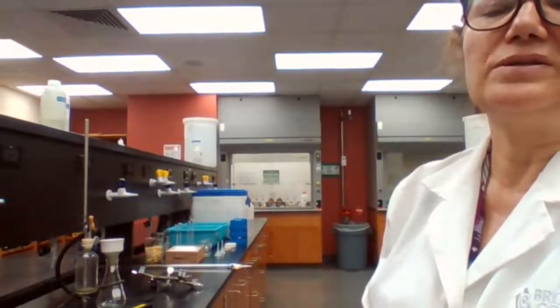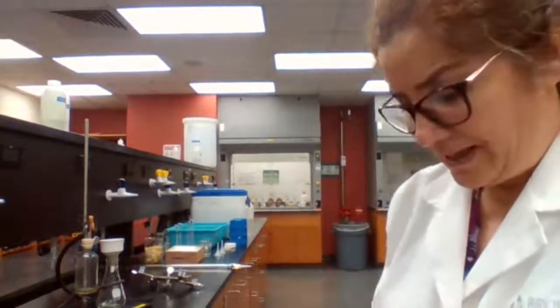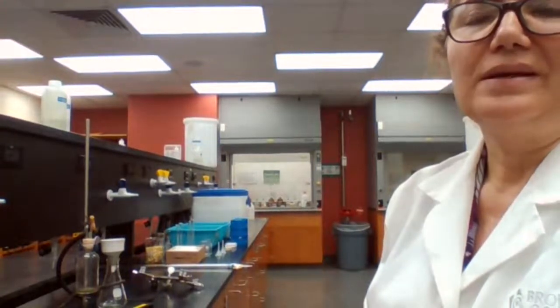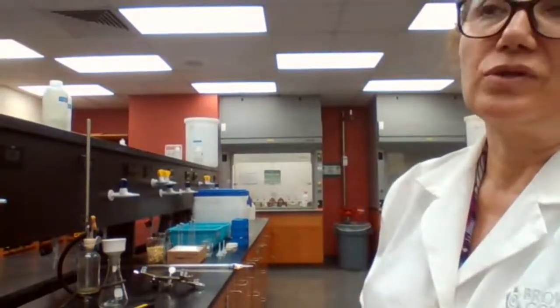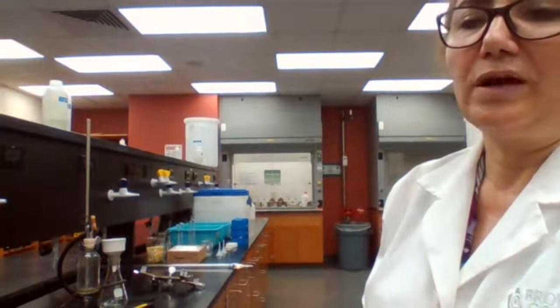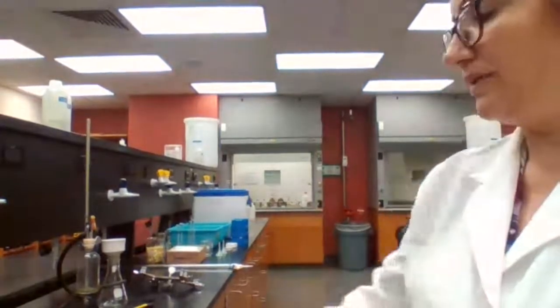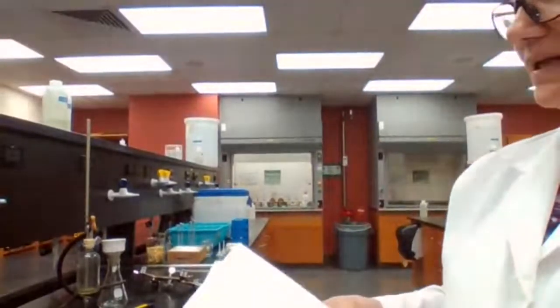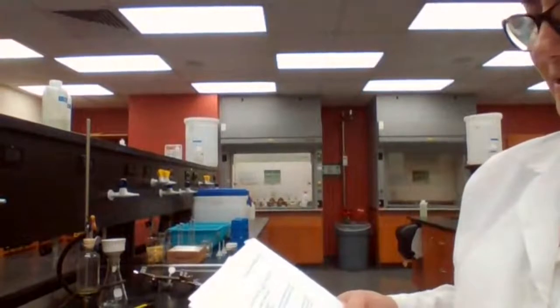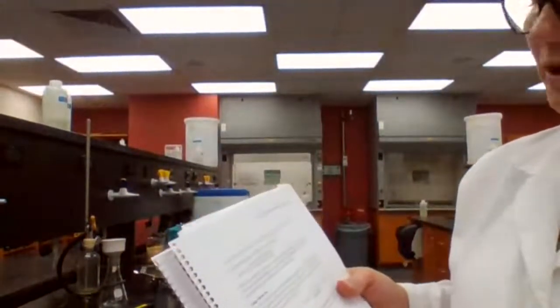So when you add sodium hydroxide, if your compound dissolves, then you can say your compound is either carboxylic acid or phenol. And next step, you have to do the sodium bicarbonate test. With sodium bicarbonate, if the compound is carboxylic acid, it would dissolve in the sodium bicarbonate. But if it's not carboxylic acid, if it's phenol, it will not dissolve in sodium bicarbonate.